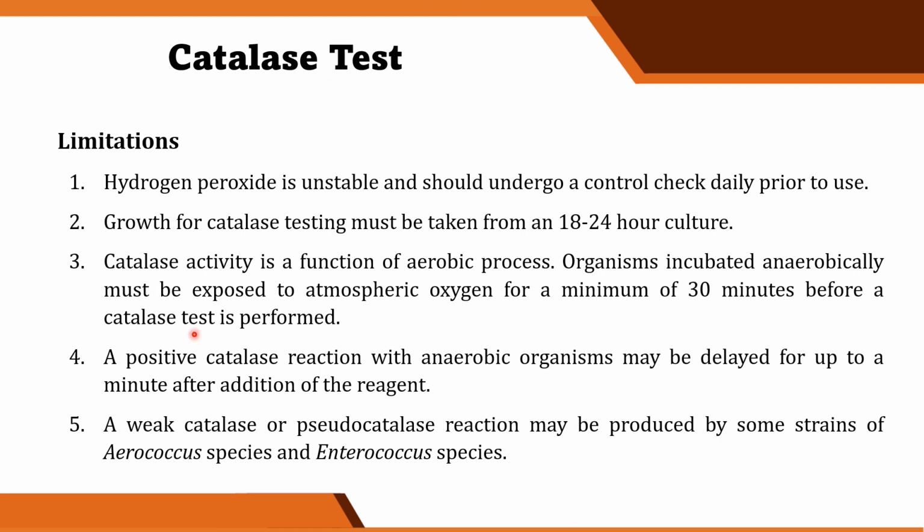Number 3, catalase activity is a function of aerobic process. Okay? So, organisms incubated anaerobically must be exposed to atmospheric oxygen for a minimum of 30 minutes before a catalase test is performed. Failure to complete this step may produce false negative results.